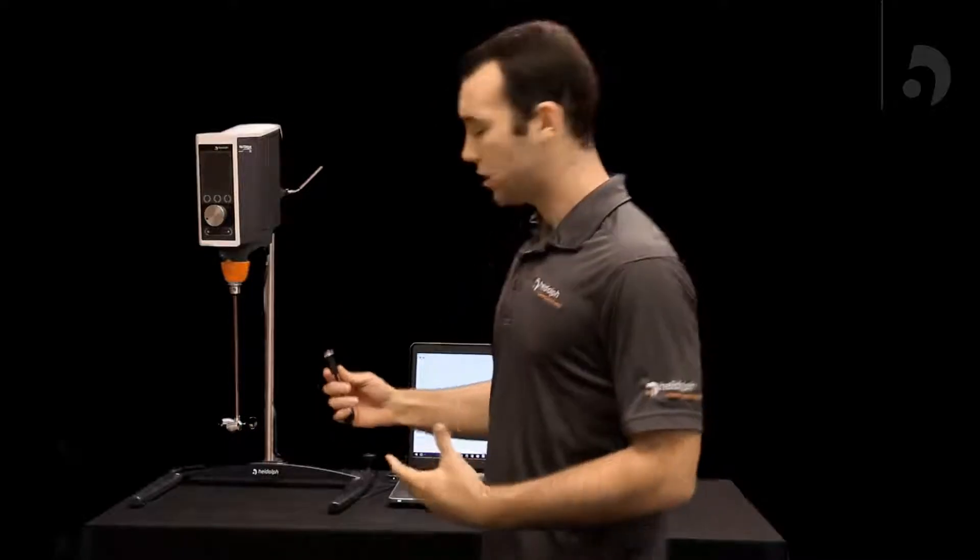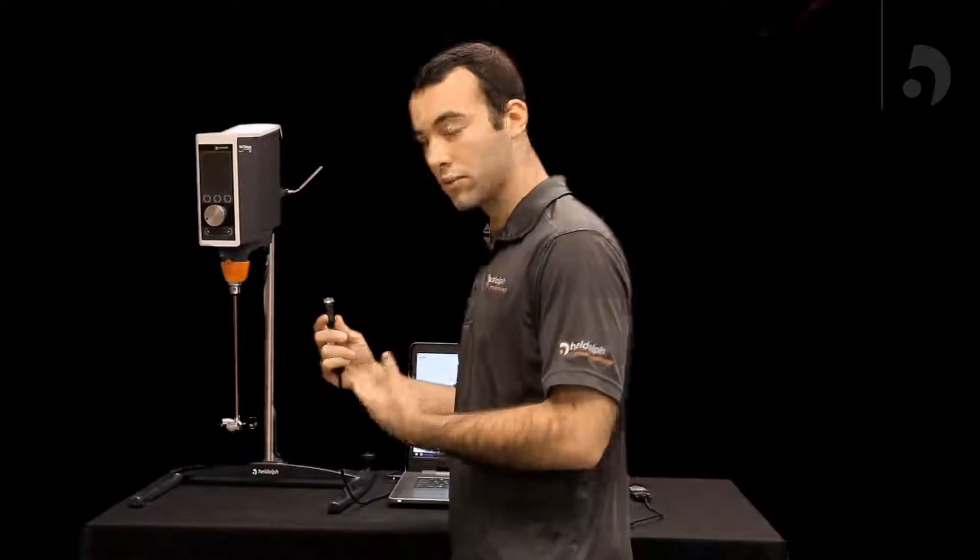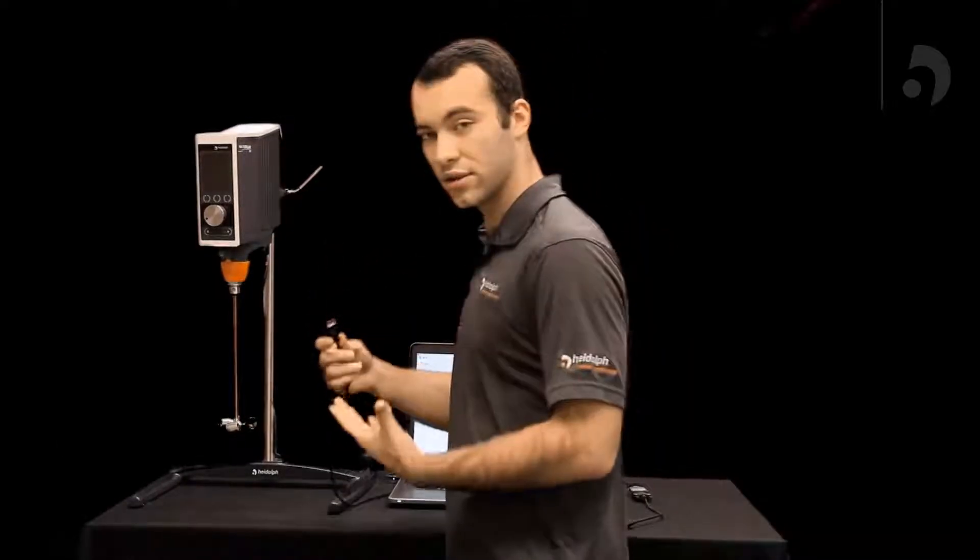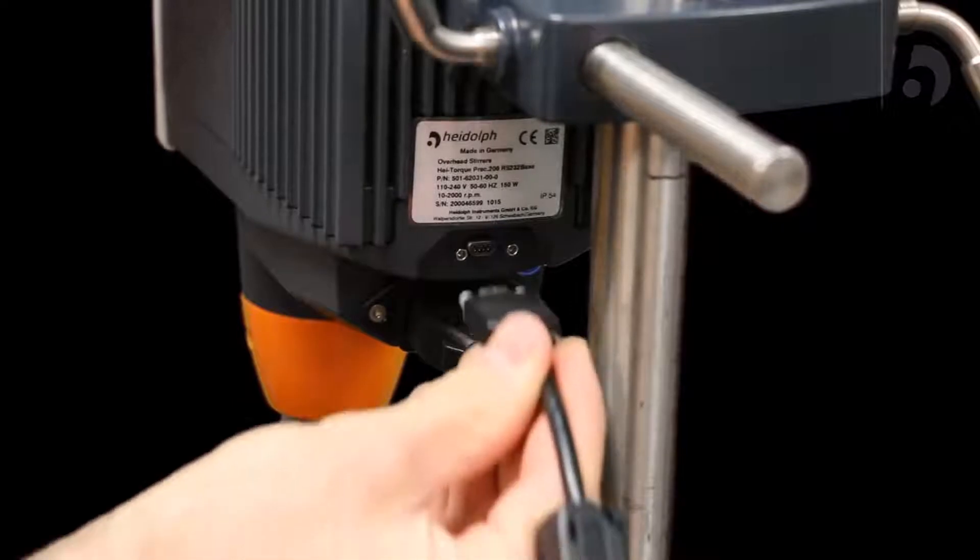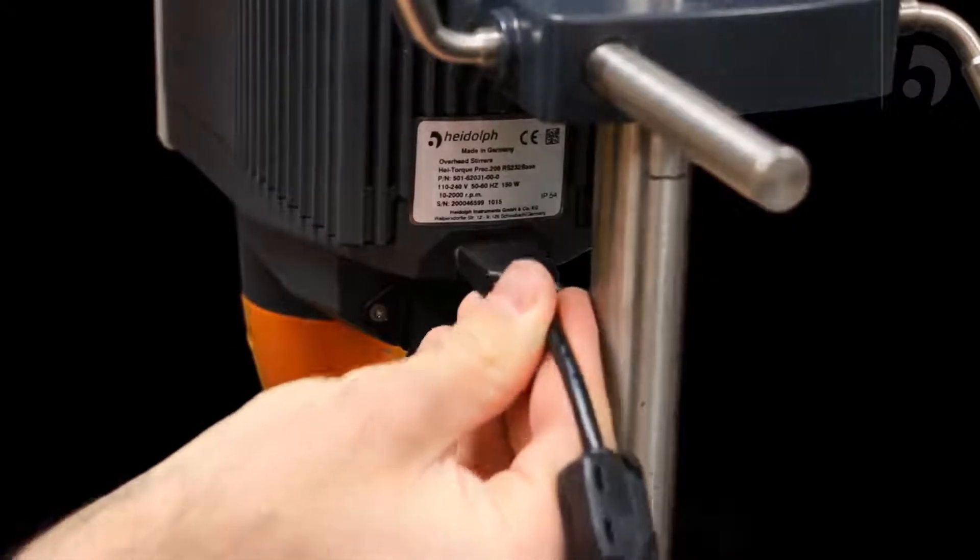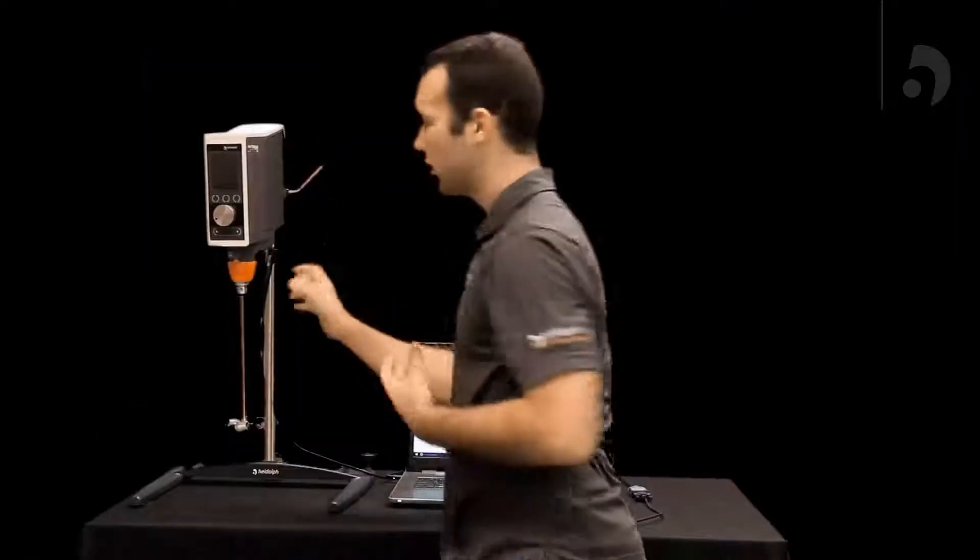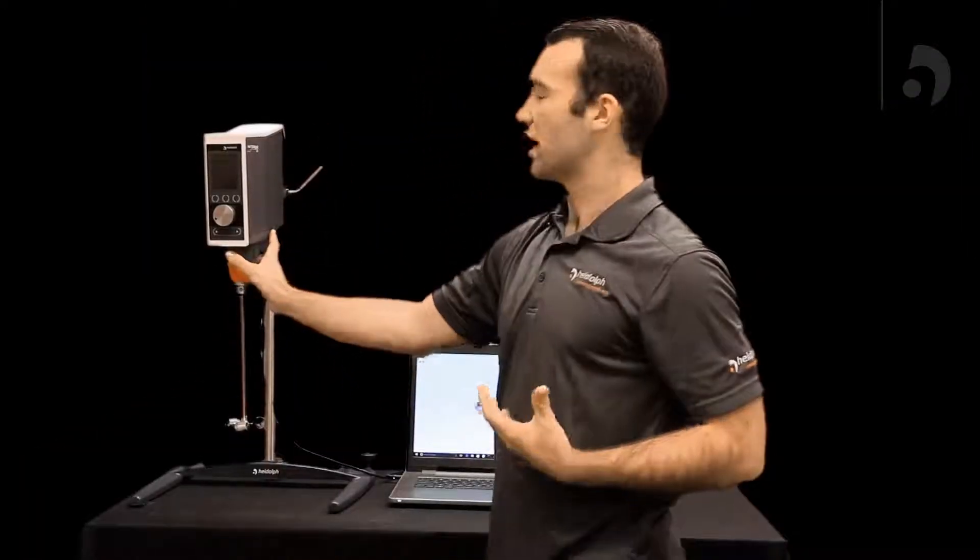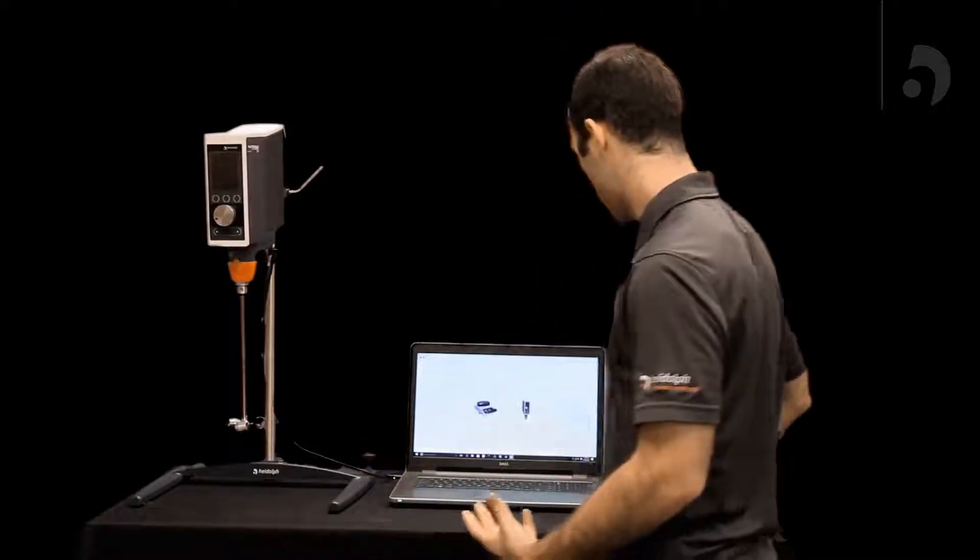So after you've got your HiTorque plugged in you're going to grab your cable, in our case the 232, and plug it into the port in the back. Once you've done that you can turn your HiTorque on and move on over to your computer.